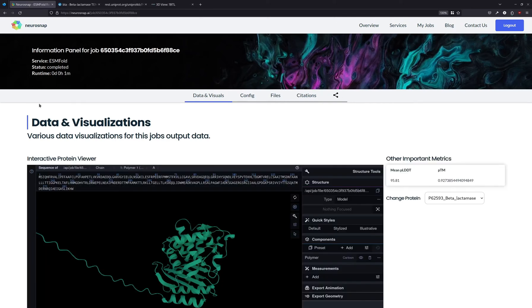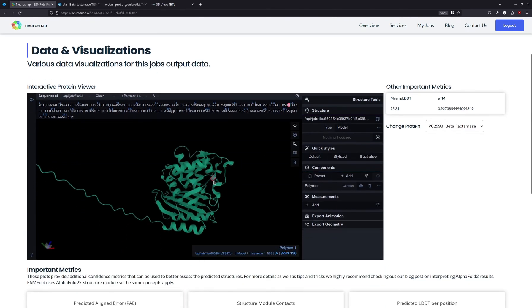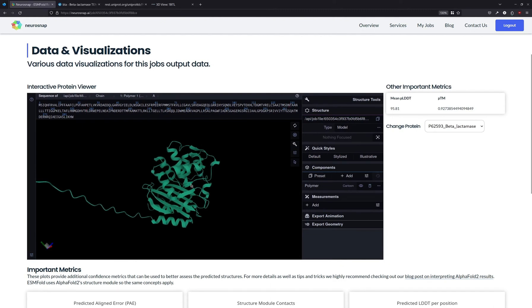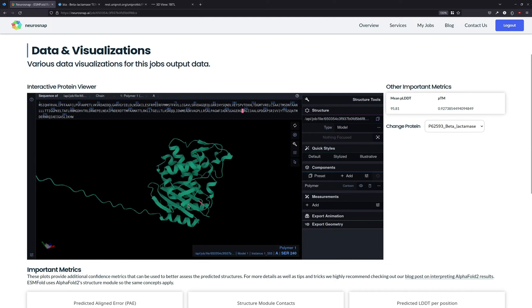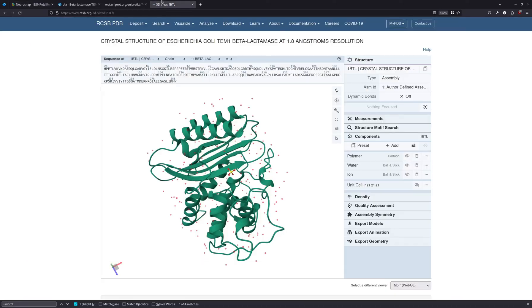As we can see, the job is now complete. It took about one minute on NeuroSnap and the structure looks very good. It seems that everything is predicted correctly. You'll notice that there's this long little tail at one of the termini. This is pretty normal, as protein termini tend not to be very well conserved, so little tails like these are quite common.